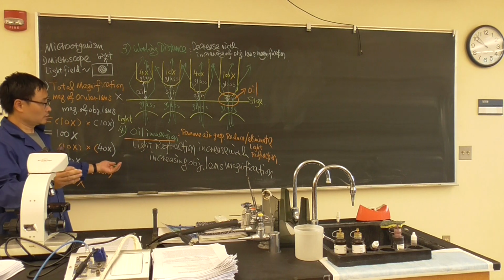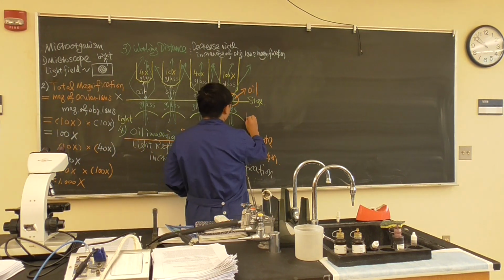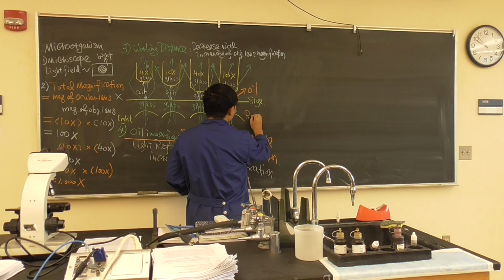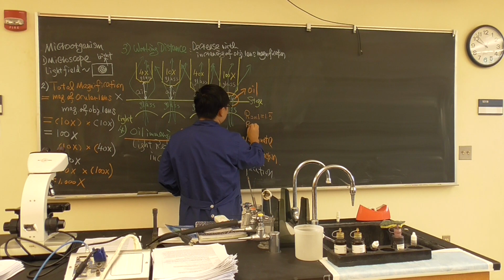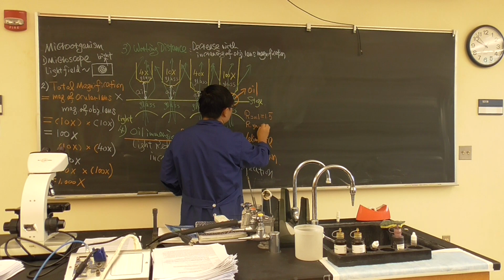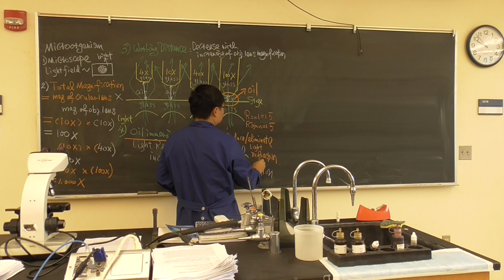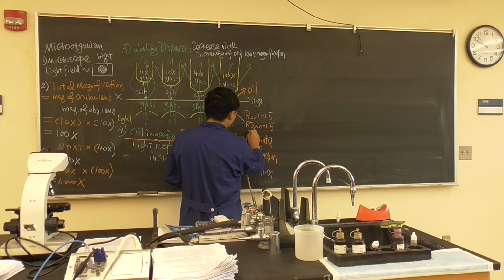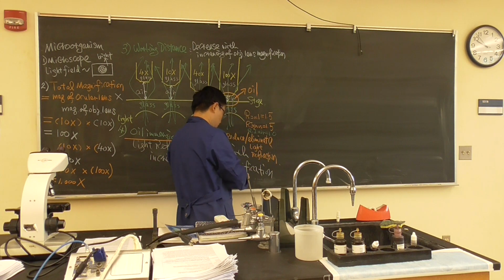Now why? Because the refraction index of oil equals 1.5, the refraction index of glass equals 1.5, and the refraction index of air equals 1.0.